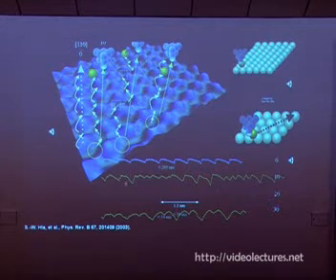Now, before I move on, I want to explain another thing. When we move the atoms, this is how the atom sees the surface. Here, the image shows the individual atoms. This is a silver 111 surface STM image, shown in 3 dimensions. These are the atomic corrugations. For example, if we have an atom here and we want to move it to a different location, this is how the atom sees it. It's not the same as the tip movement. For example, the atom wants to move along this direction. This is the lowest diffusion barrier, so it's easy to move. But if you want to move it in different surface directions, it's difficult for the atom to move because of the corrugation. So this is how the atoms move.